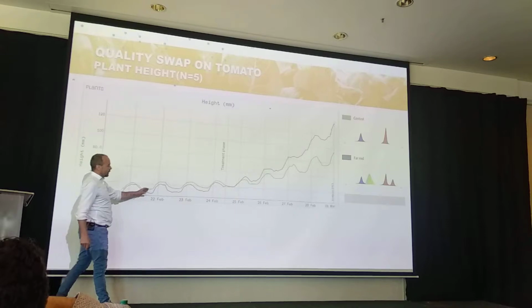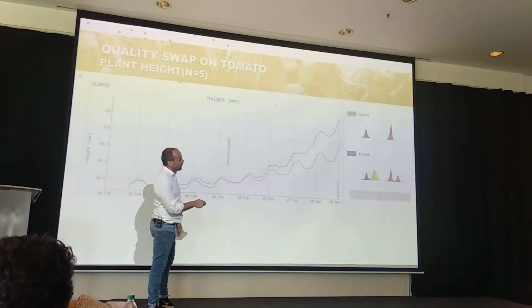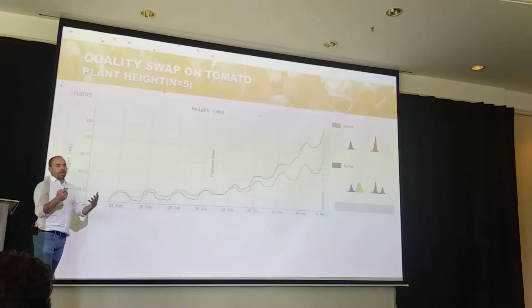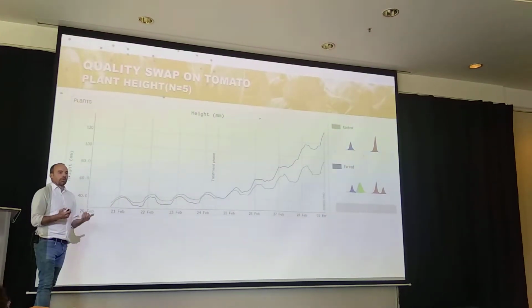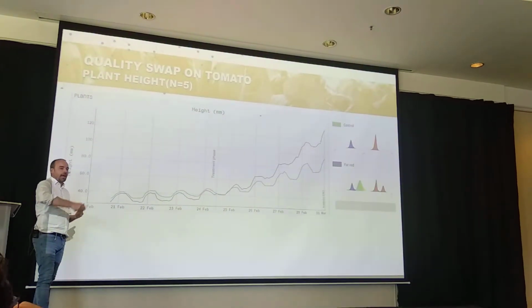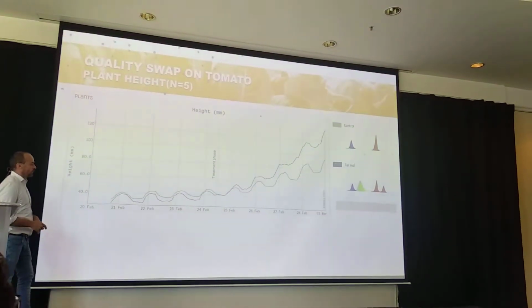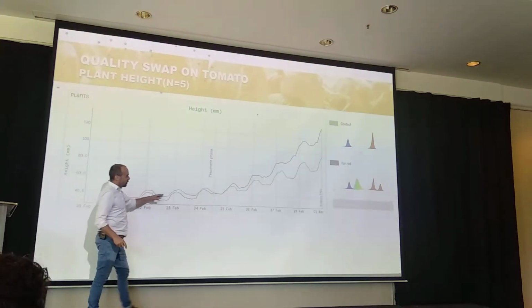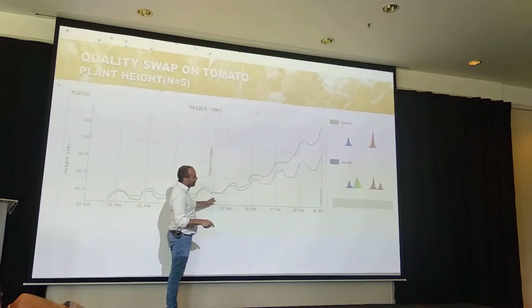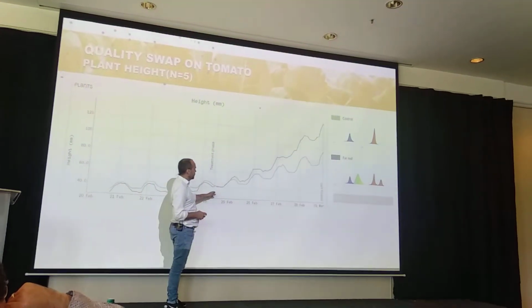These plants here had exactly the same light treatment, so that was blue together with red, and we wanted to add far red and see how this influences the growth. We knew, it's not rocket science, that if you add far red there will be an elongation, right? So we want to see how quickly it goes. So again, the plants grew, and then we swapped. We added far red here, by the way, thanks to Sebastian, because he provided us the light recipes.